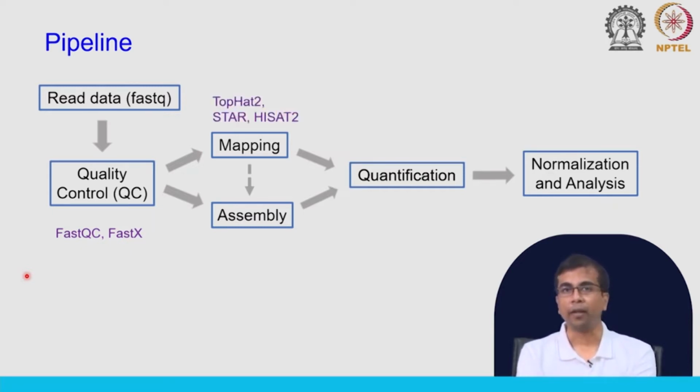Then we have the mapping tools for RNA-seq data, and you see these are different. We have TopHat or TopHat2, STAR or HiSat, and HiSat2. I will briefly mention these mapping tools today. We will talk about the algorithms of one of the tools in this class.